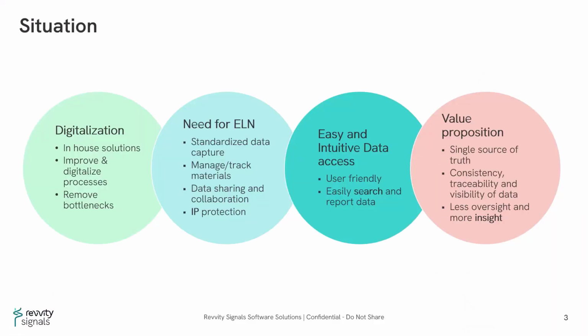You might be at different stages of your digitization journey of your laboratory work. Currently, you might be capturing your data in paper notebook or in various different file formats. It could be Excel files, or it could be a GraphPad Prism file. If you have sequences, you might be using various different proprietary bioinformatics tools such as SnapGene or DNA Star. You might be looking to improve and digitize your process and thereby removing bottlenecks in terms of data visibility.